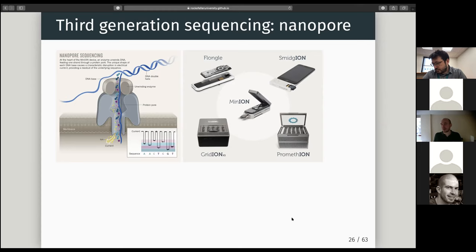But I think it was 3 years ago now that they tried and started the process of purchasing PacBio, because they understand that the future is in long read technologies in any case, especially now that, as we'll see, the PacBio sequencing technology is actually matching the quality of Illumina reads, but with also much longer sequences.